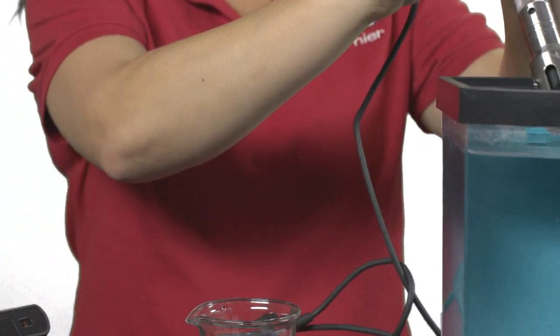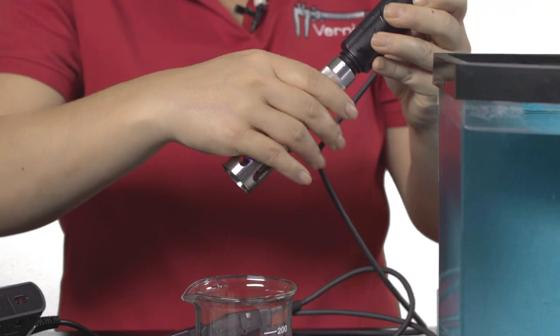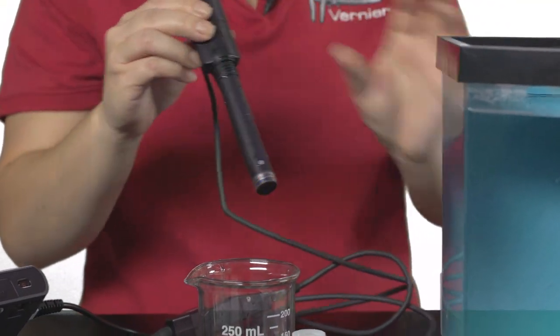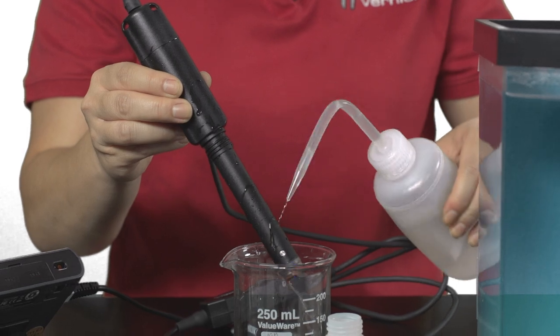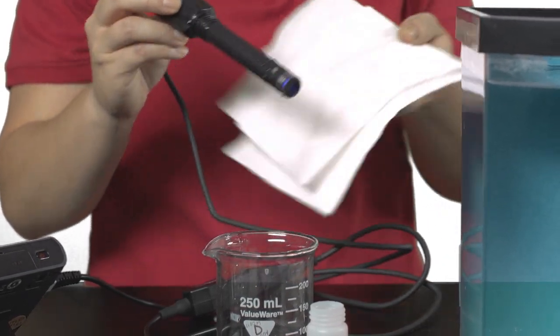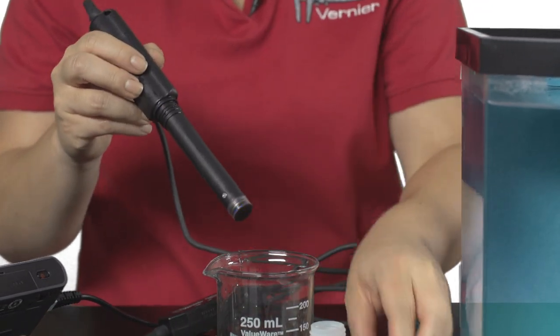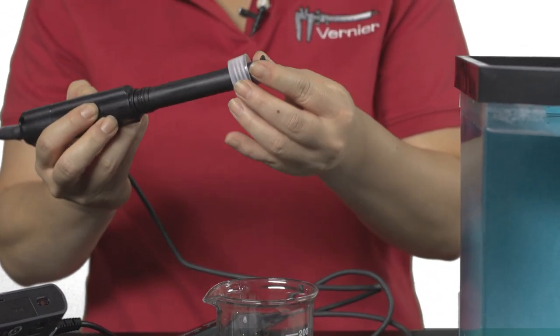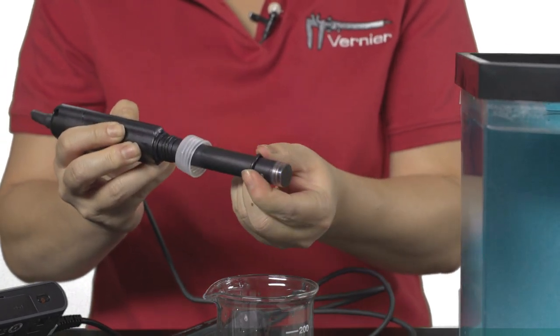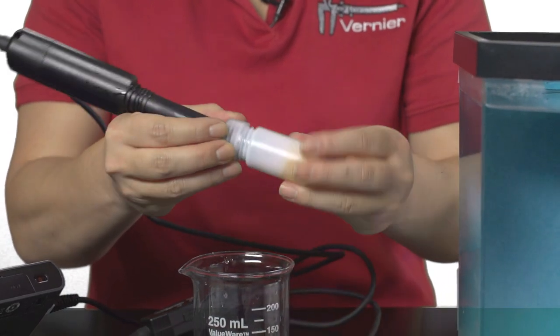When you have finished using the optical DO probe, rinse the tip with distilled water and gently blot dry. Place the optical DO probe back into the storage bottle and tighten.